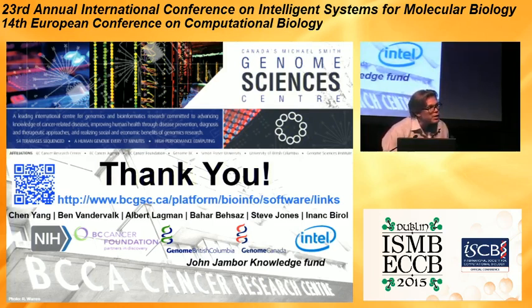Right. Yeah, we filter those out. We actually track the multiplicity of k-mers. I didn't mention that, but this is tracked in our data structure. So we only pair contigs if these k-mers are found uniquely in the contigs. However, if the distances between the multiple k-mers along the long read are similar but match different contigs, what will happen? Like I said, if a k-mer is found multiple times, so if you have a pair where you have k-mer i' and i', and this one also pairs with i''', we essentially don't use that pairing. Okay, thanks. You're welcome.